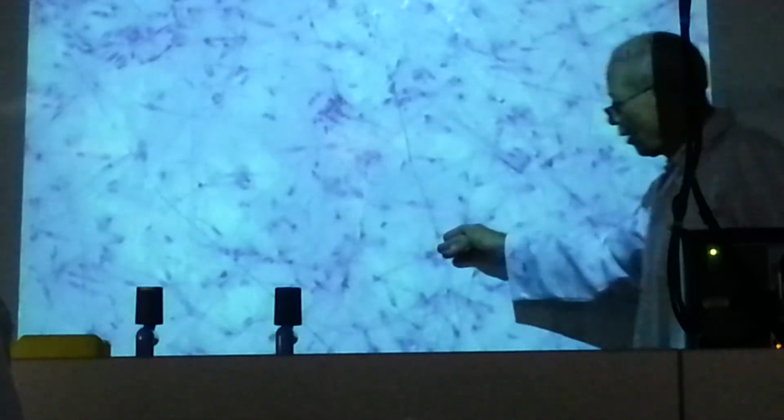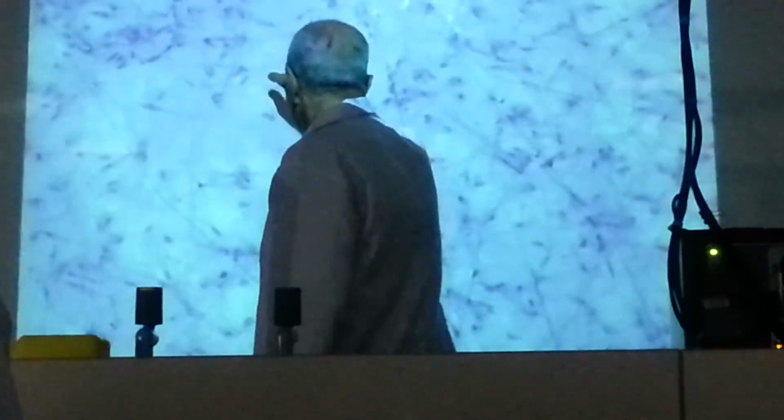Now to the connective tissue. But don't forget the previous one, which is the dense regular connective tissue. What is this type of connective tissue? Loose areolar connective tissue. Why? Connective tissue fibers, connective tissue cells together with intercellular matrix. Okay? One more time. Loose areolar connective tissue.